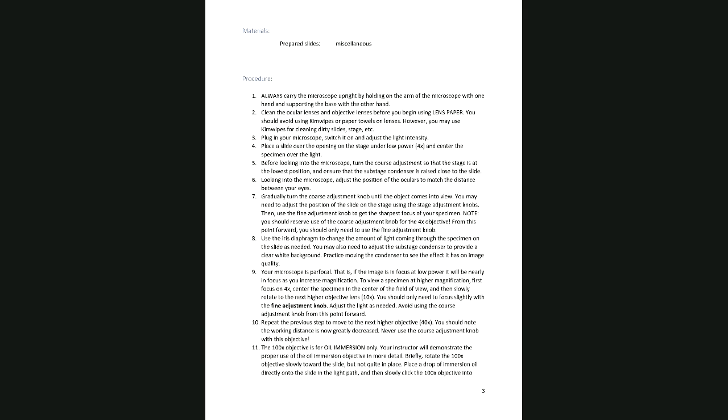So let's say that you're focused on the high dry. Remember, you have to open up the iris to let more light in. Then you're ready to add the oil. So the way to do that is you simply move the high dry lens out of the way.